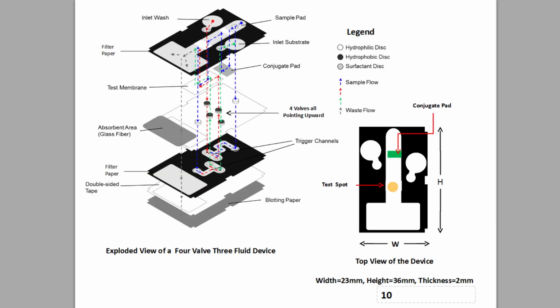In this slide, I am showing one of the chips we fabricated to conduct this assay. On the right side is a top view of the chip, and is similar to what I have shown previously. On the left side is an exploded view of the device.